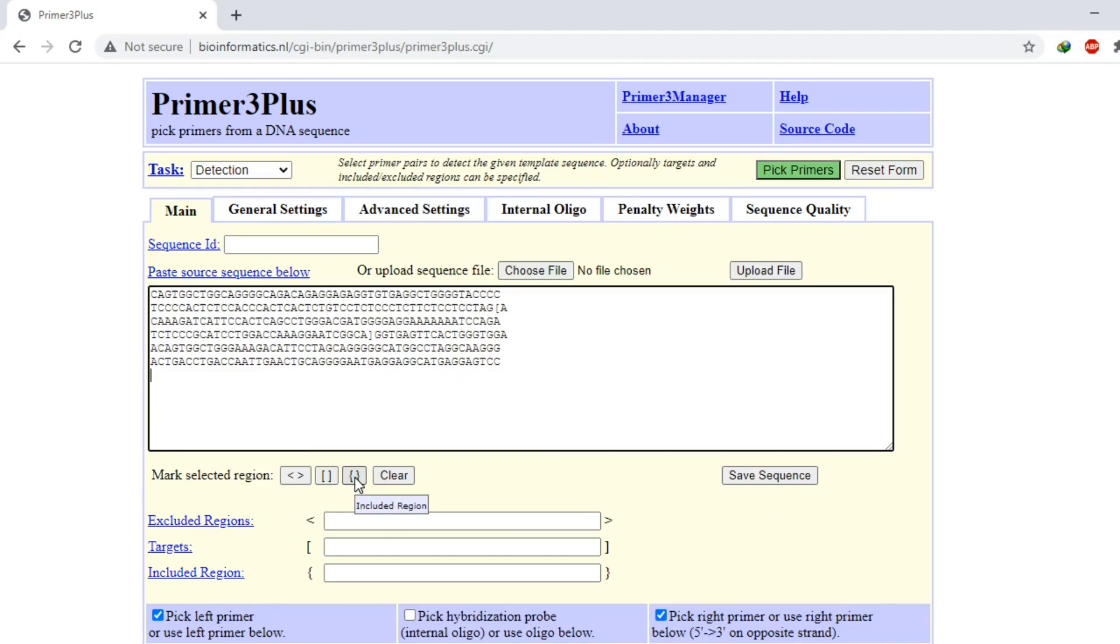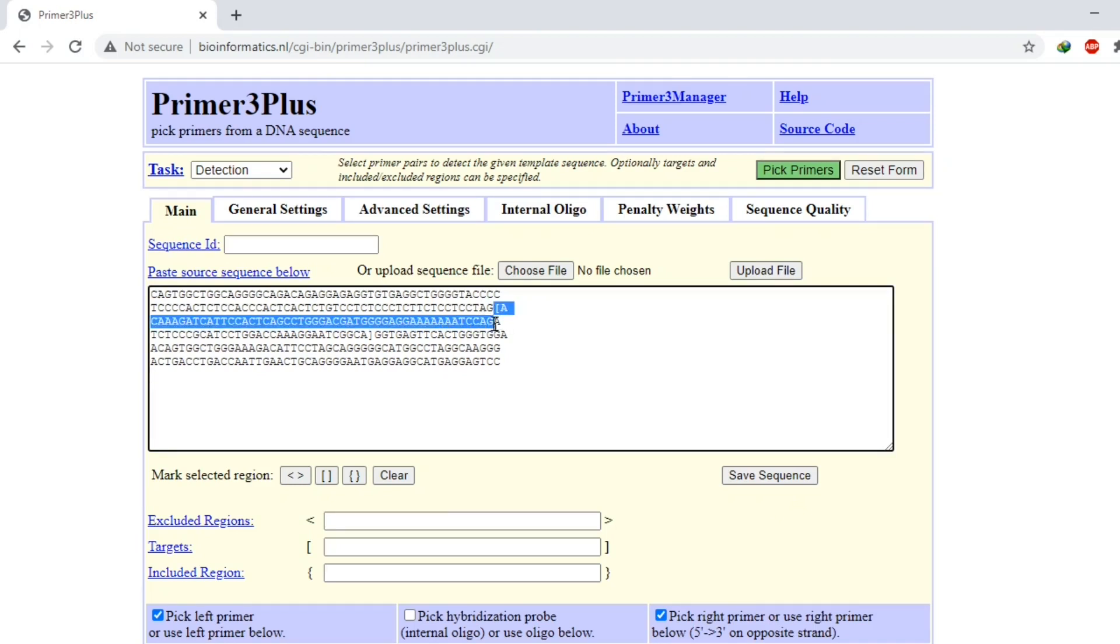I have already selected my region using square brackets, which is this one.